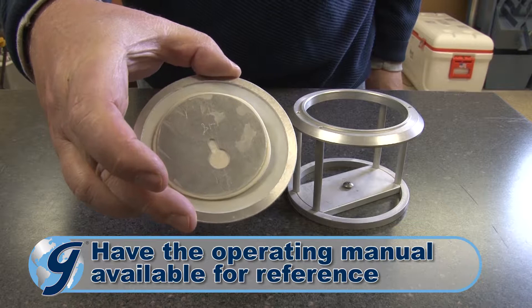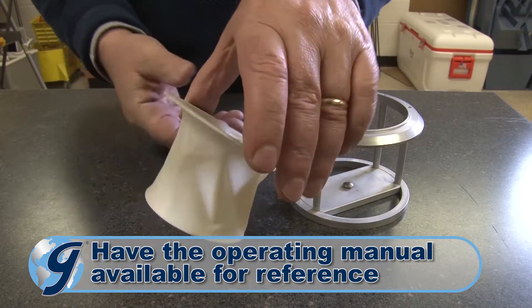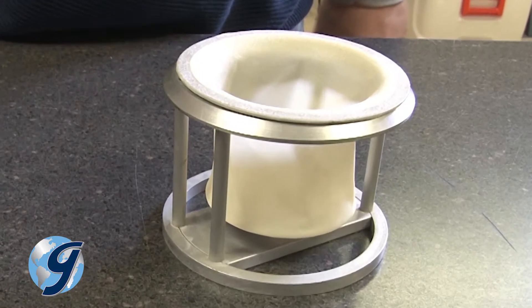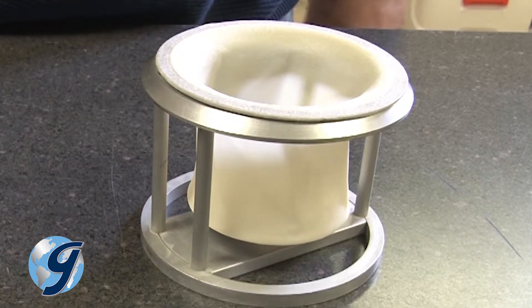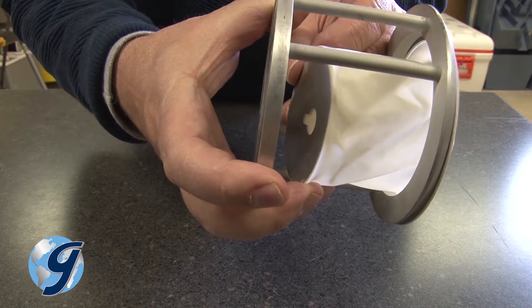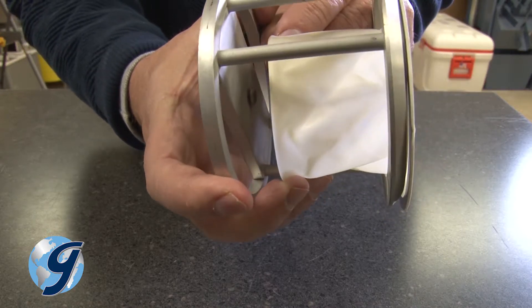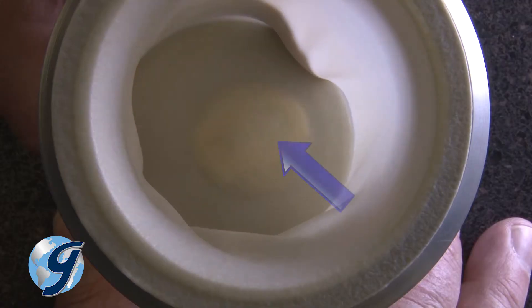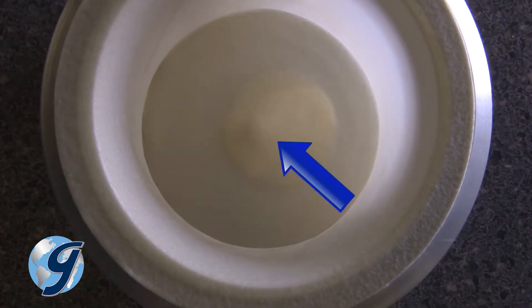Next, place the fines collector into the fines collector holder. The top ring of the collector should nest in the recess of the top ring of the holder. Attach the fines collector bottom to the fines collector holder by inserting the keyhole slot of the fines collector disk through the screw head of the holder.